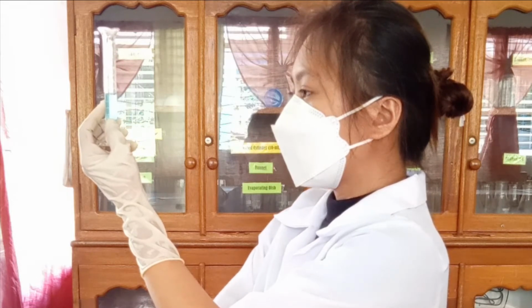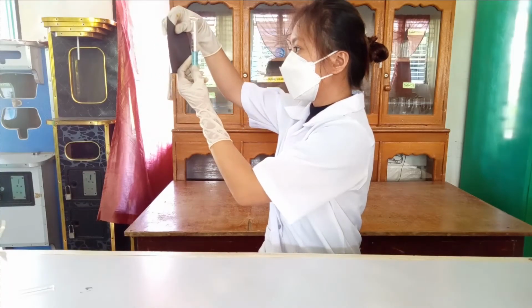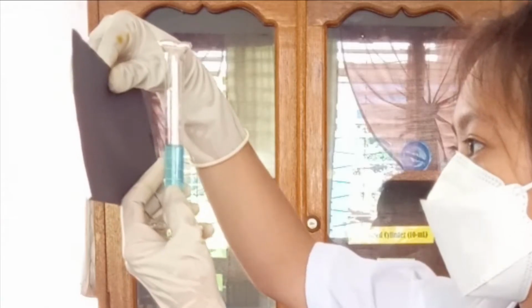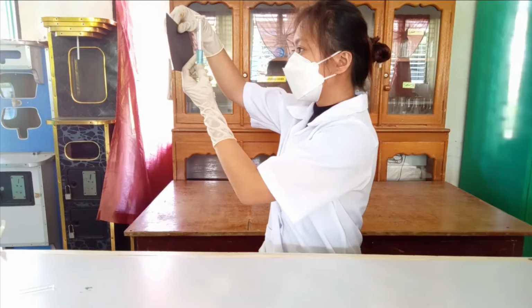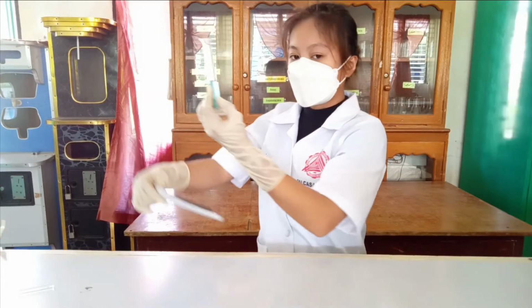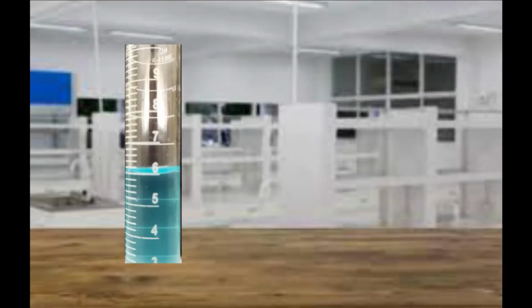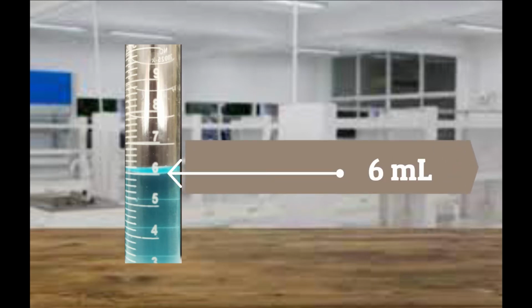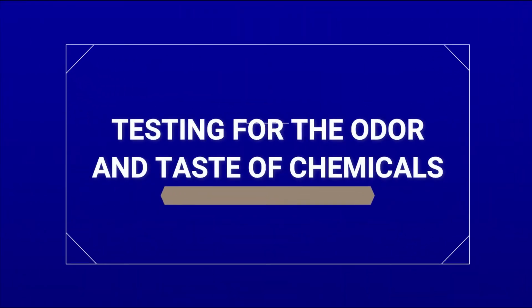A clear or transparent liquid is read more easily by positioning the top edge of a black mark just below the level portion of the liquid. The black background reflects the bottom of the lower meniscus and better defines the liquid's level. Substituting a finger for the black mark will work, but not as effectively. In this case, the bottom of the meniscus is sitting on the 6 ml line, so the volume of the liquid is 6 milliliters.